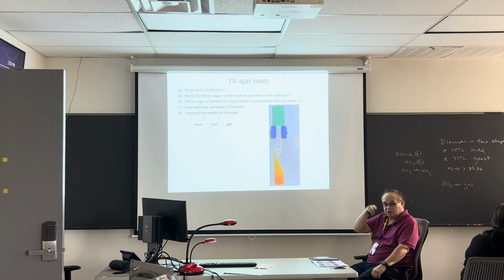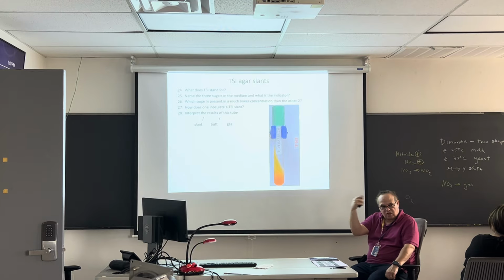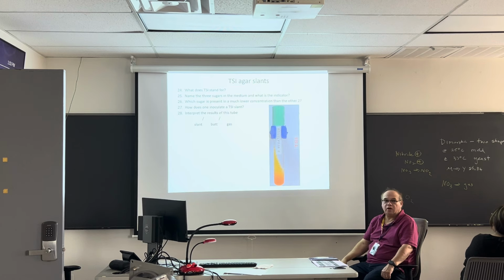So now you have to listen to me, right? If you are taking it in an alternate format, I've had enough description in it that it should be there. But in the classroom, I'm going to say it's yellow here and it's orange there, and you're going to say what goes here. A, and no gas. Why?